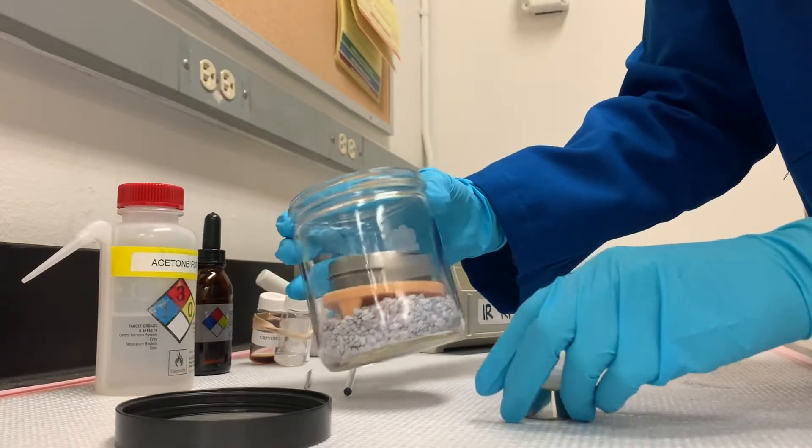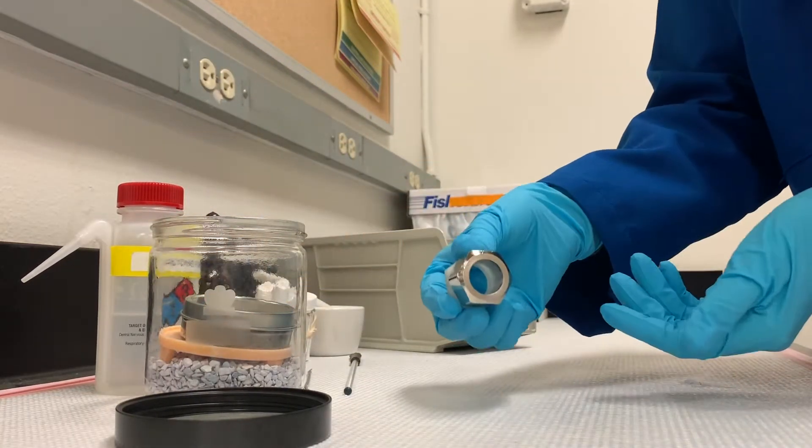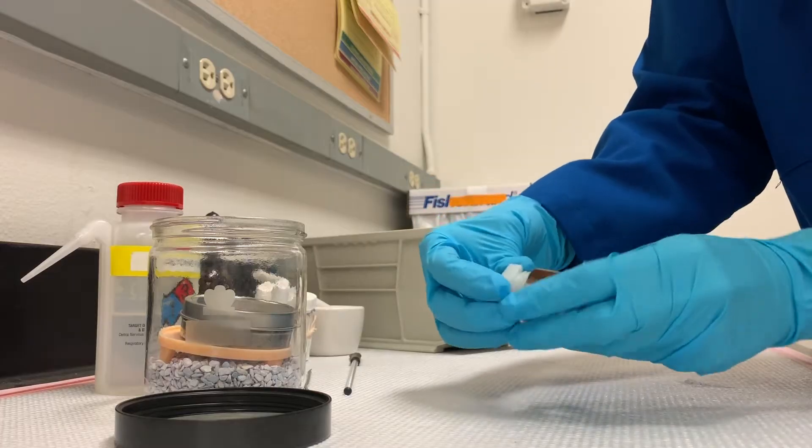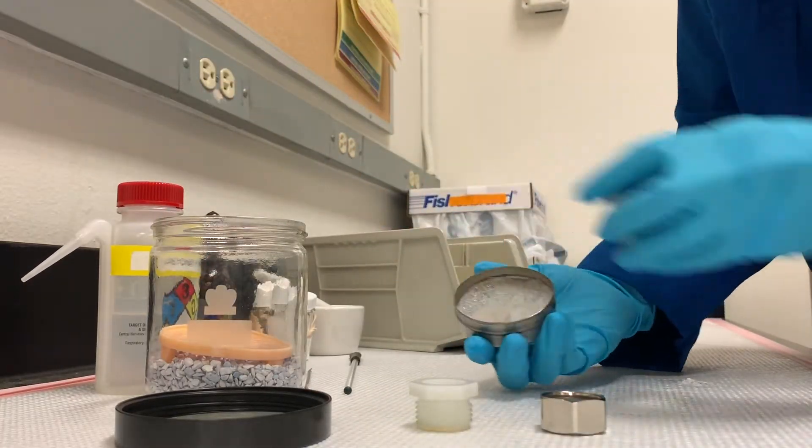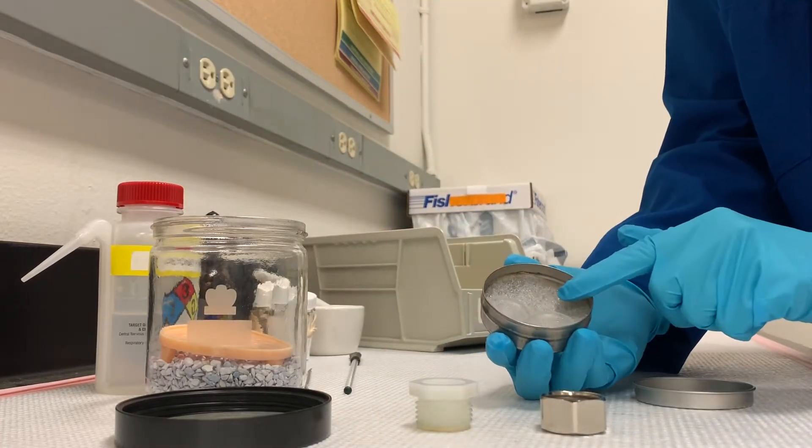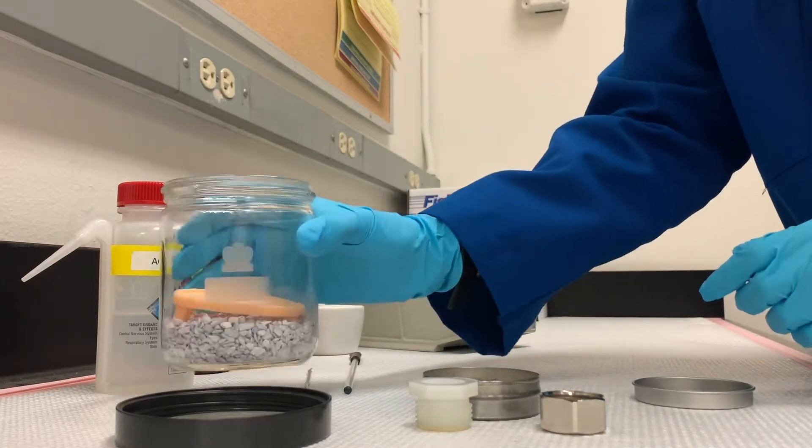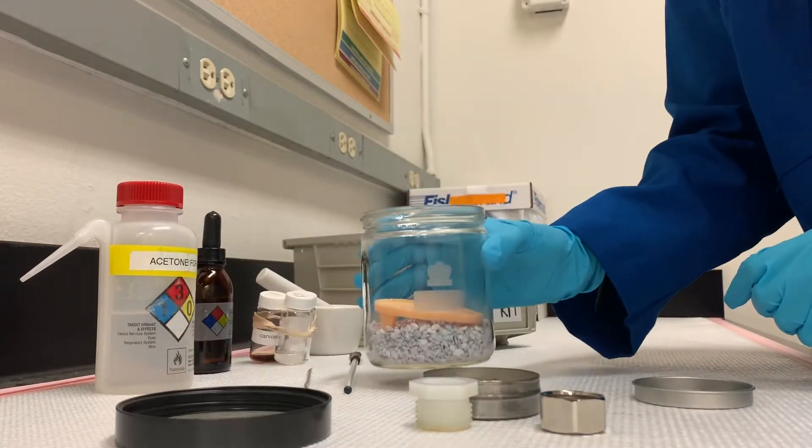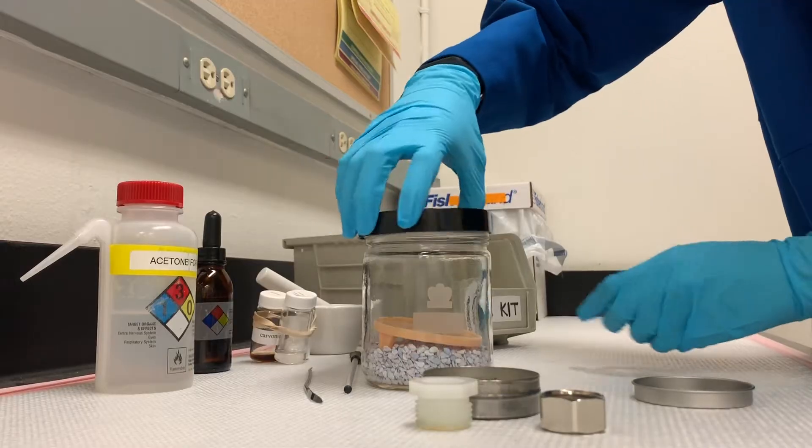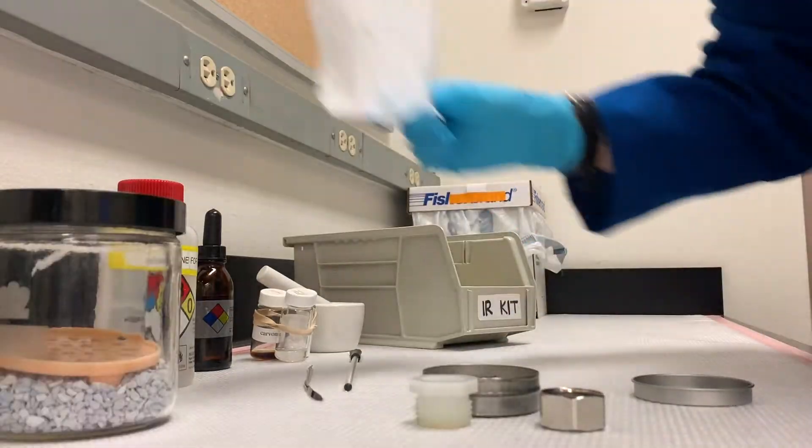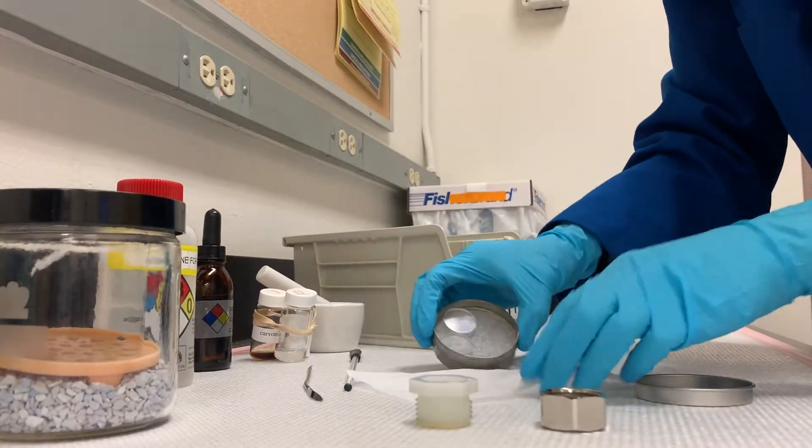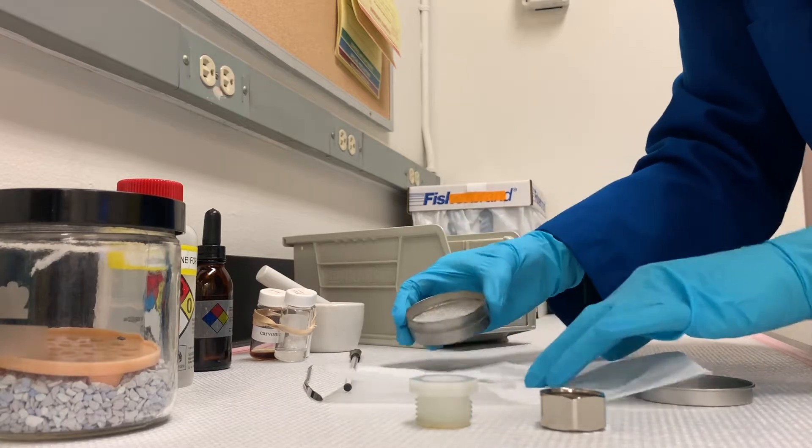This is our desiccator, it keeps our salt plates dry. We have a sample holder here in two parts. We have in here our very delicate, very expensive salt plates, sodium chloride, and this desiccant has to stay dry, so we keep this closed at all times. Rather than placing on bench paper, we're always going to place on kim wipes.